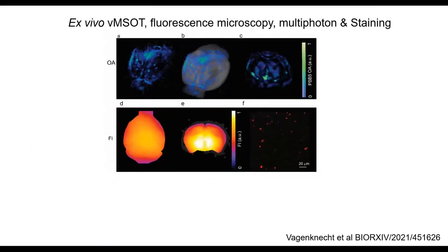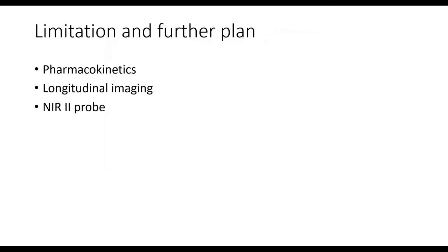Ex vivo validation is performed using photoacoustic imaging as well as fluorescence microscopy and multiphoton imaging. For the limitations, I want to mention that we have not performed pharmacokinetics in the above-mentioned study. In addition, longitudinal imaging will be essential to enable utility of this method. And in addition, a second near-infrared window probe will be great and enable better signal.